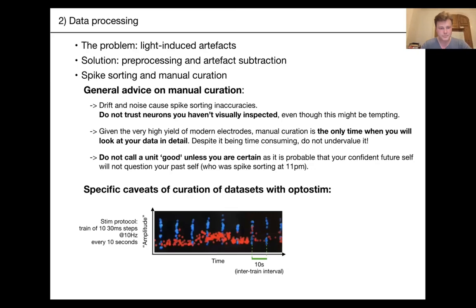Here are some specific caveats for curation of datasets with optostimulation. Sometimes you'll see in the amplitude view of Phy that spikes are locked with a period of exactly 10 seconds — matching the stimulation protocol of trains at 10 Hz every 10 seconds. You can use this view to manually clip away spikes that are actually artifacts clustered together with a neuron by Kilosort. The PSTH of this unit is obviously artifactual, but you can work in Phy to get rid of it.